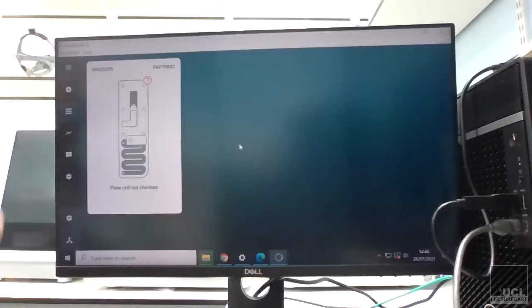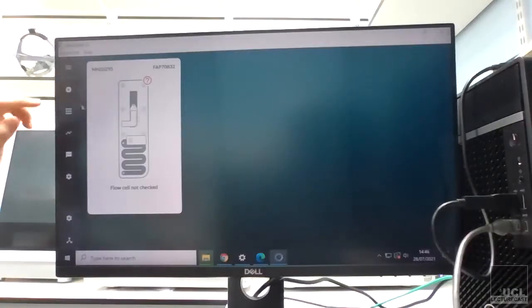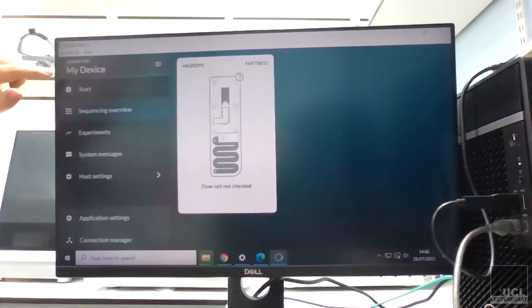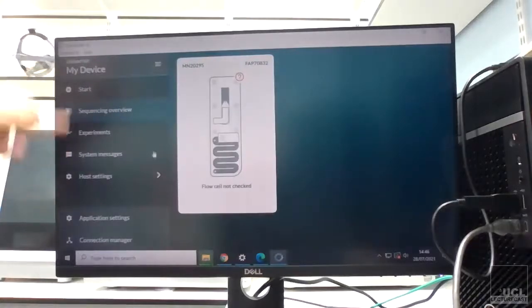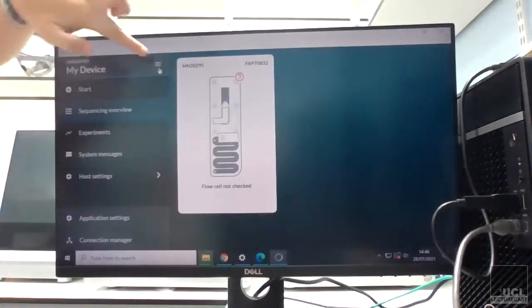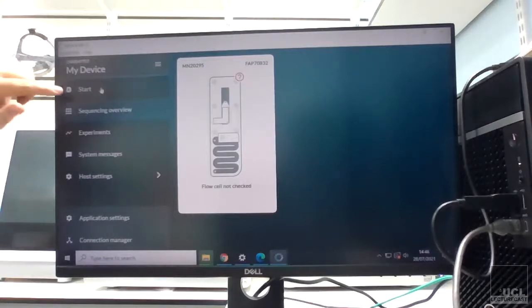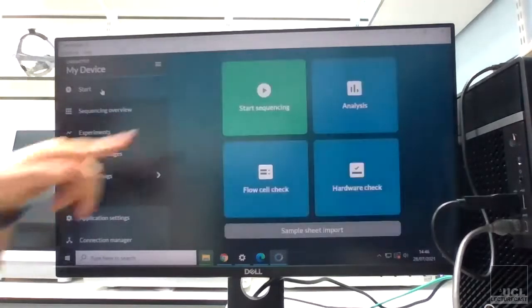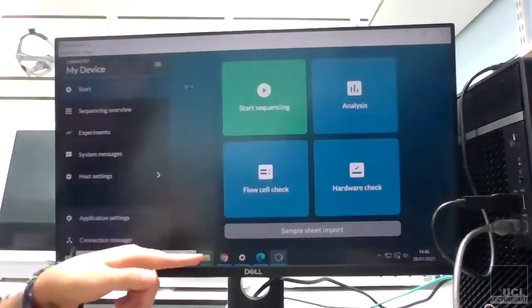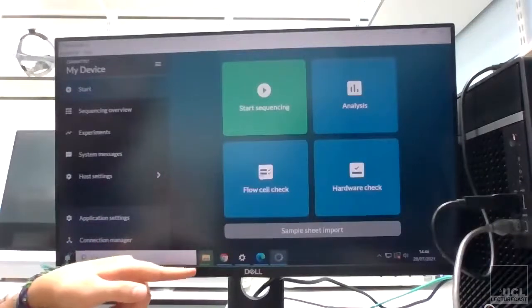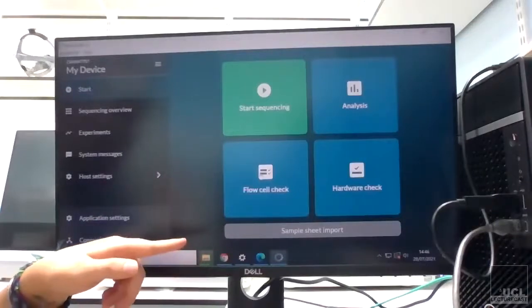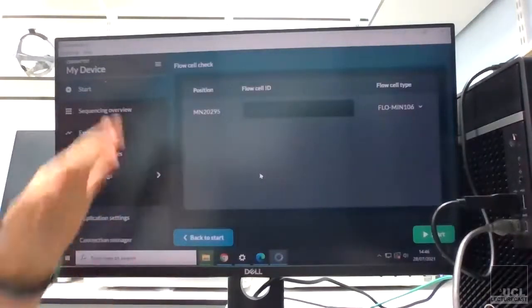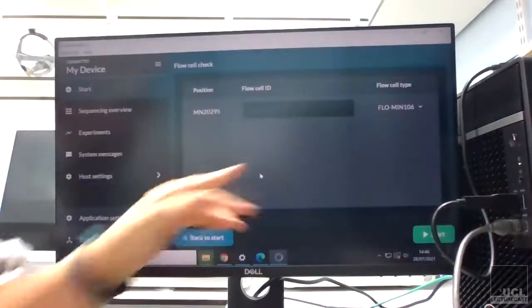So the way we can do that is if we go—I'll open this up here—so you can just click on the three little lines and this brings up your kind of menu. If we go to Start, which then brings up this panel here, and we can go to flow cell check.